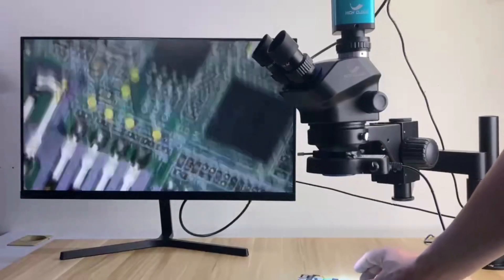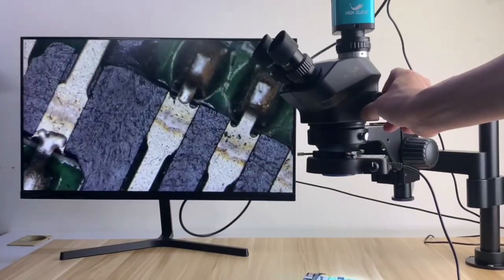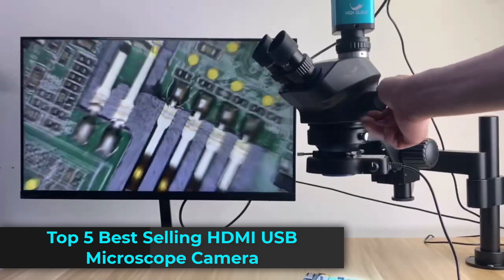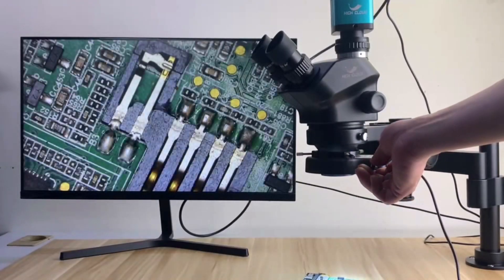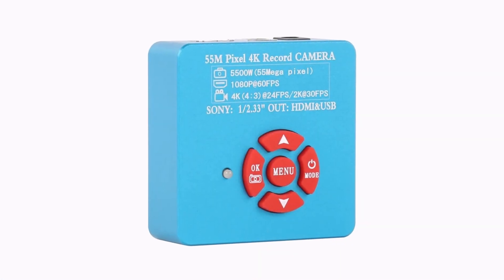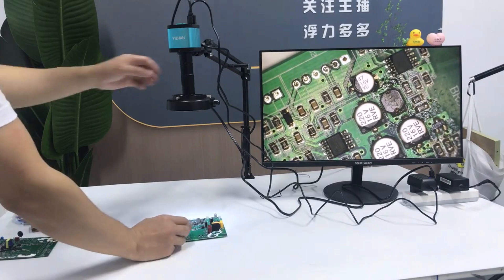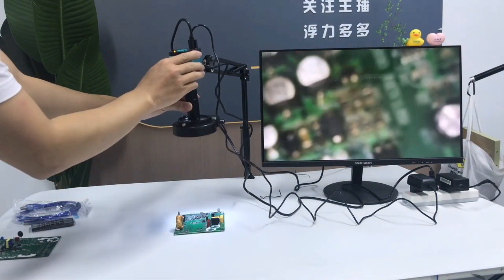Looking for the best HDMI-USB microscope cameras for your inspections or projects? In this video, we're showcasing the top 5 best-selling HDMI-USB microscope cameras that combine high-resolution imaging and ease of use. Whether you're working with electronics, biology, or other detailed inspections, these cameras offer unmatched clarity and convenience. Stay tuned to find the perfect model for your needs.